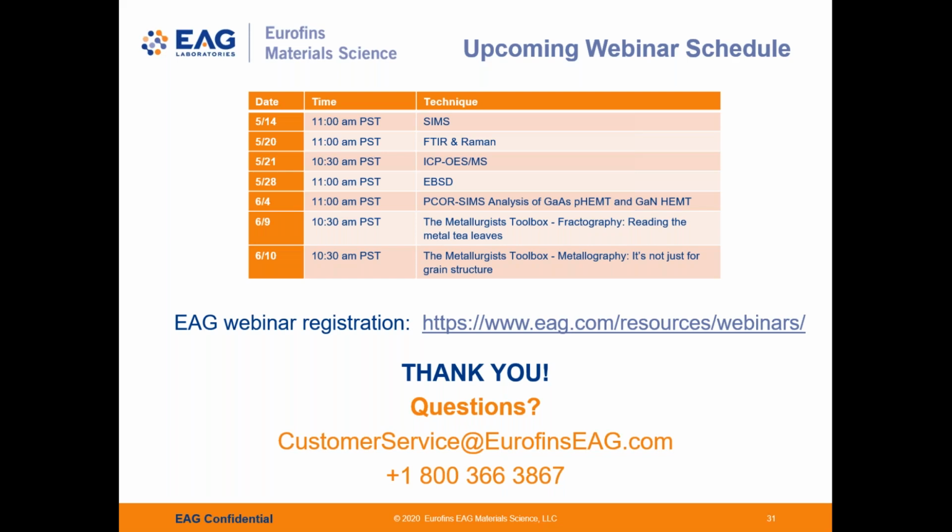Coming down, maybe going further up, tellurium also, I think, and antimony. It depends on how able we are to achieve a background-free condition. If the film elements are well separated from each other, for example, tantalum nitride, then we can achieve ppm levels. Also, if the substrate is lighter than the elements present in the film, then there's a good chance we can achieve ppm levels also.